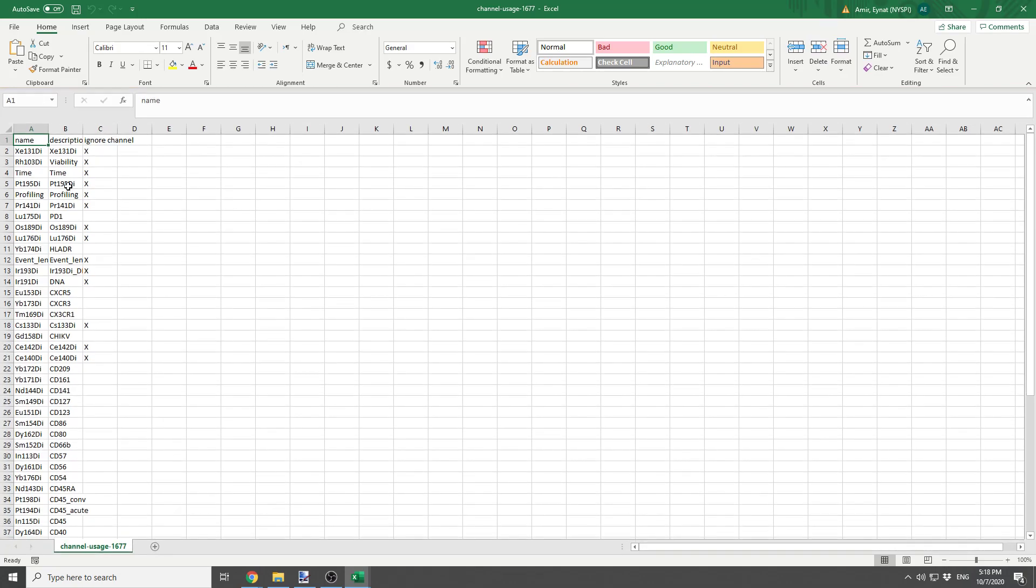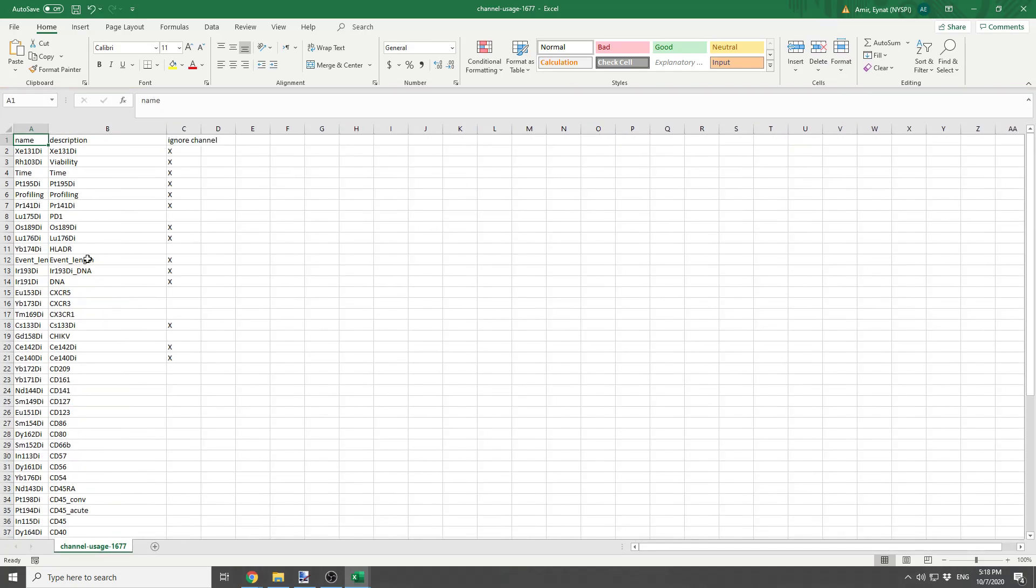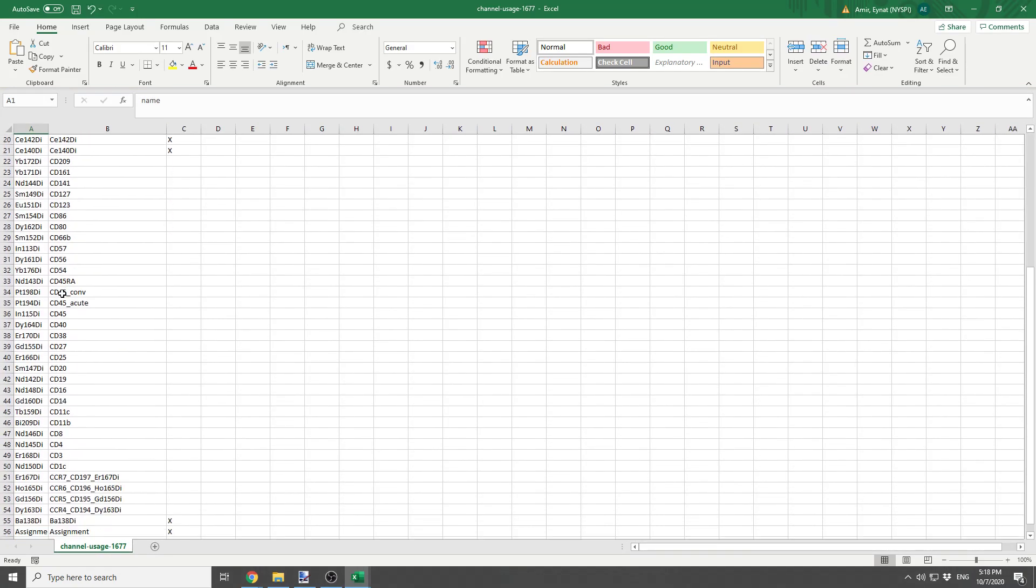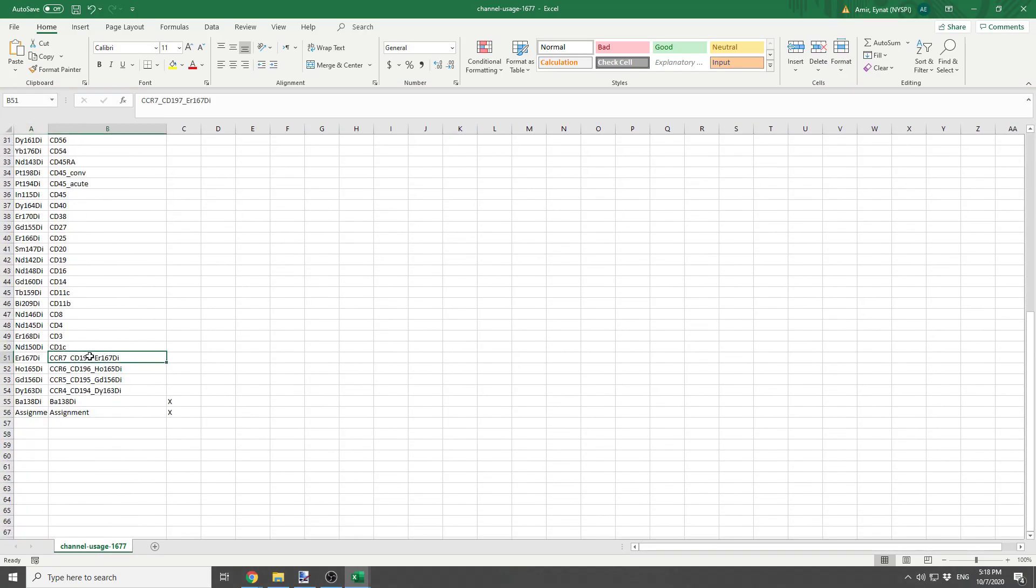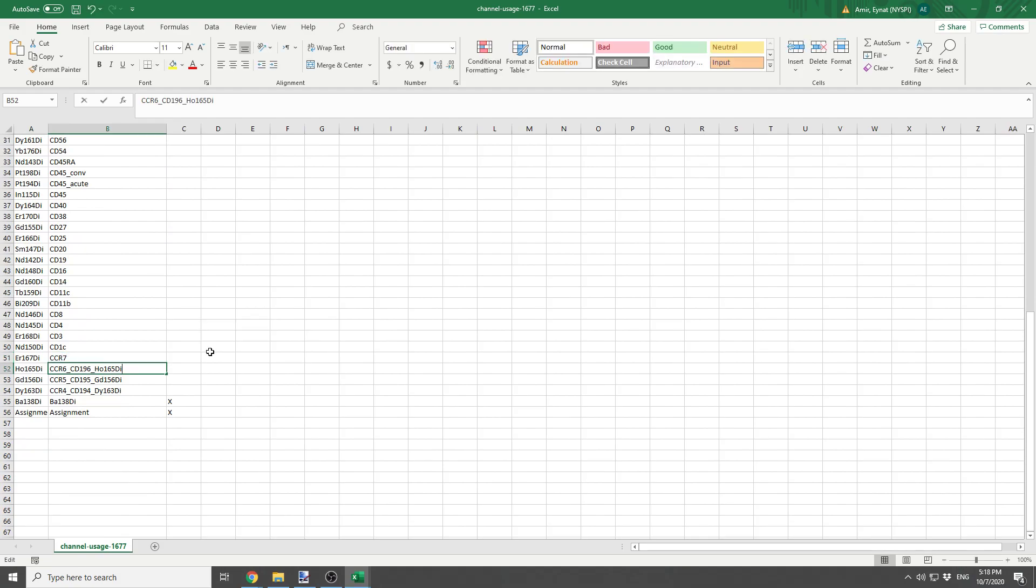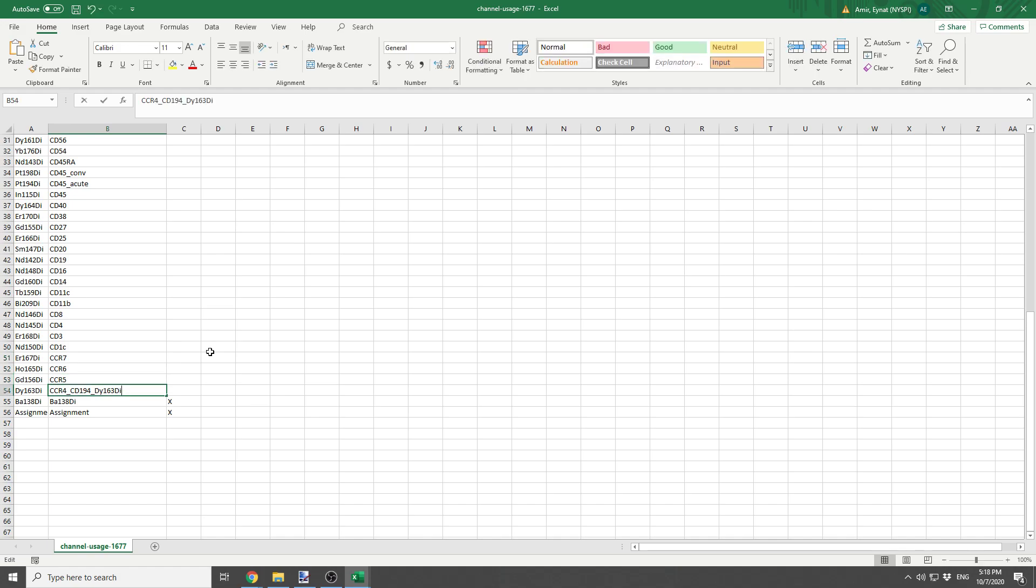And first of all, I'm going to change some of these column names to something which is a bit more amicable for further analysis.